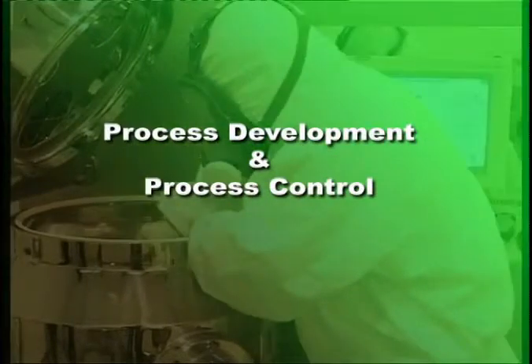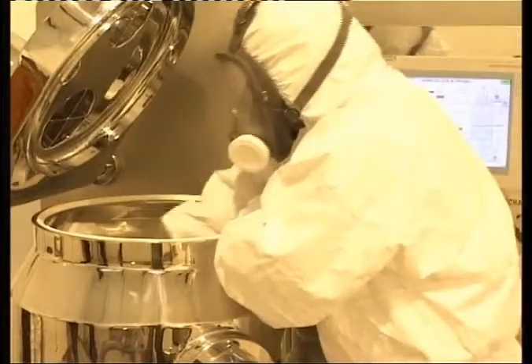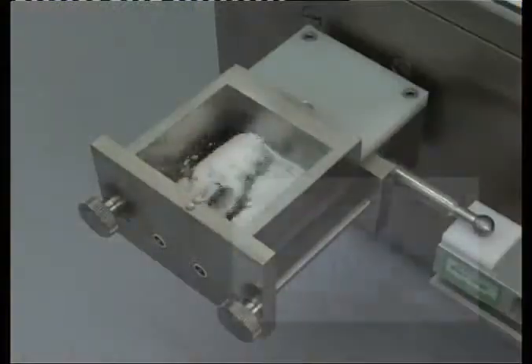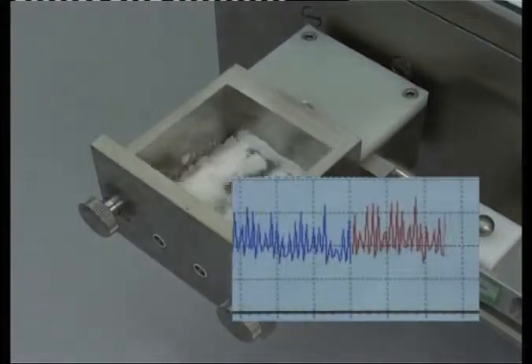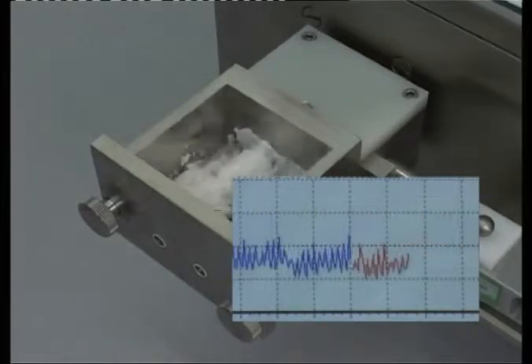The MTR is ideally suited for monitoring the consistency of wet masses produced with production-scale mixers because it uses such small sample sizes. The consistency measurement may be used to indicate the equivalence of rheological properties of mixes, even between granulators of different size or design. Ultimately, the consistency measurement may be regarded as a pseudo-viscosity term, which can form part of a predictive scale-up strategy.